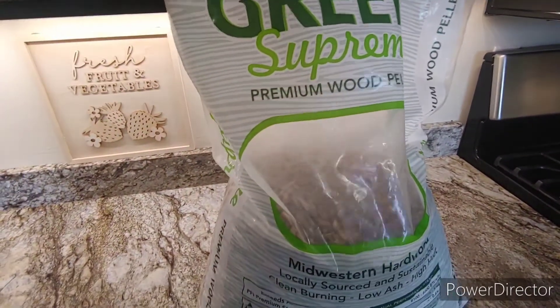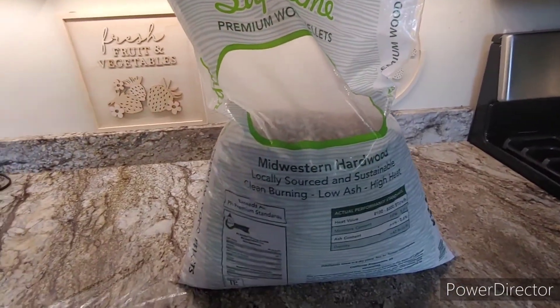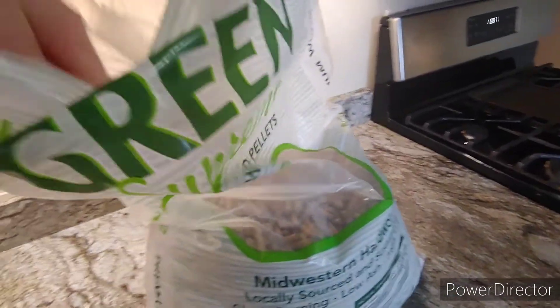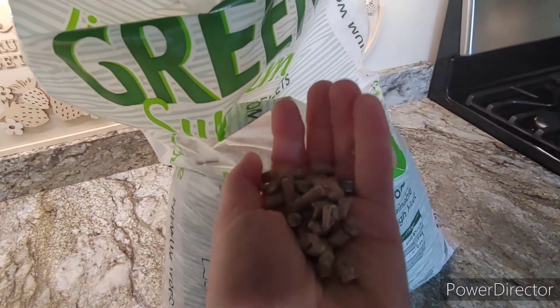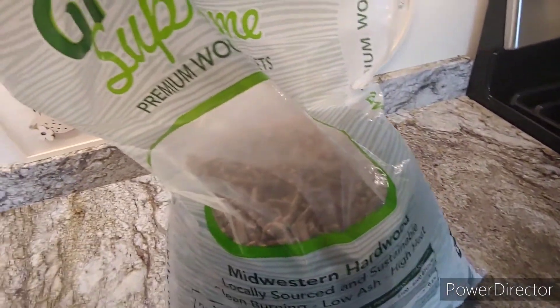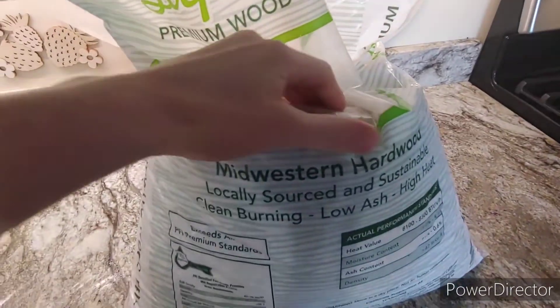So the first thing you're going to want to do is get some of these hardwood pellets, which are used in pellet stoves. These are really just compressed sawdust — that's all this is. Looks like hamster food or something. You want to get an all natural hardwood — that's really what you want.